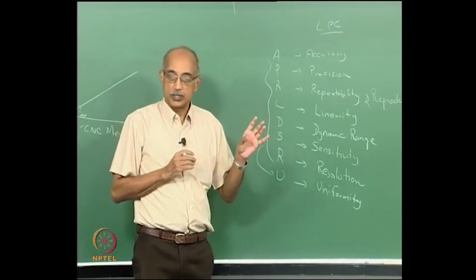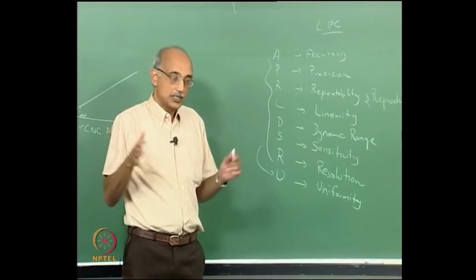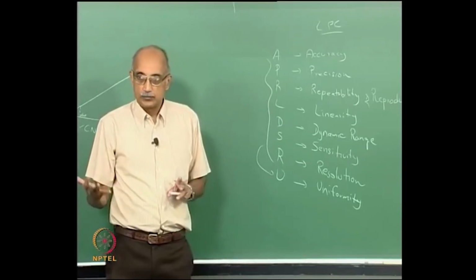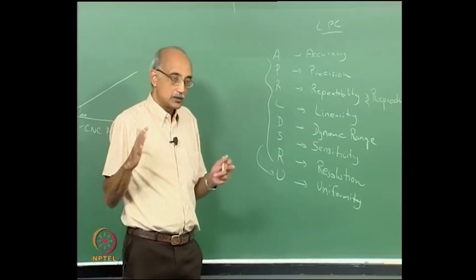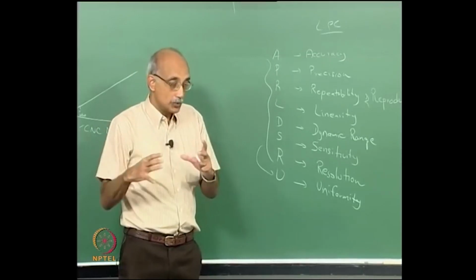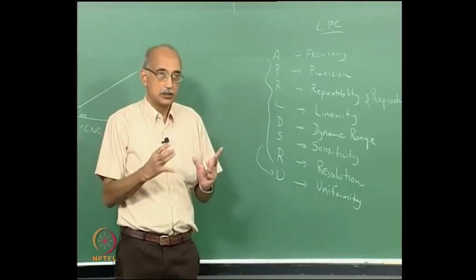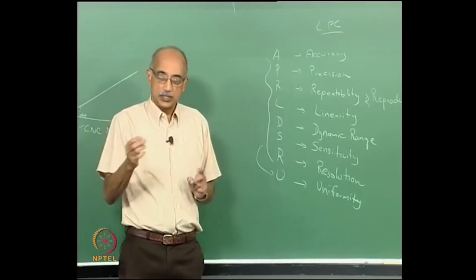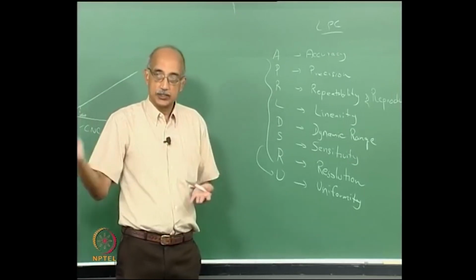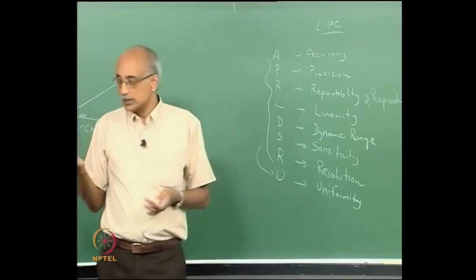For example, if you are using a light scattering instrument in your lab to do size measurement, then you set up a silver standard which is also a light scattering based particle counter, except that it is used only in a very controlled environment, and only for the purpose of calibrating other particle counters. The silver standard is calibrated against the gold standard, so the calibration becomes a two-step process.